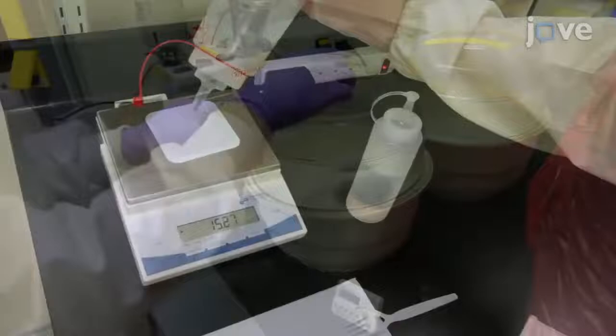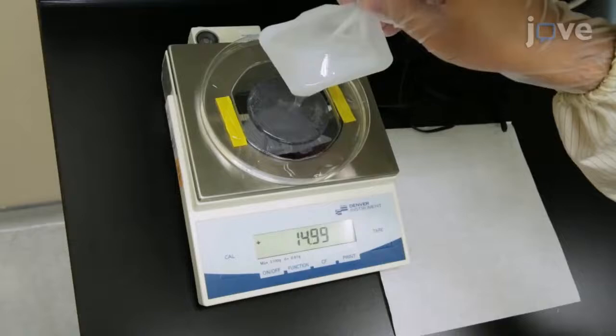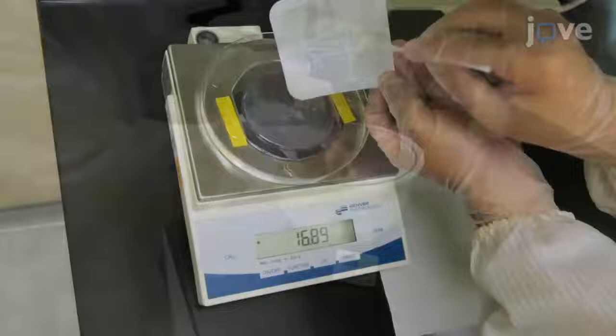Mix the PDMS base and PDMS curing agent at a ratio of 10 to 1, then pour a total of 20 grams of the mixture onto the wafer mold in a 15 cm dish.